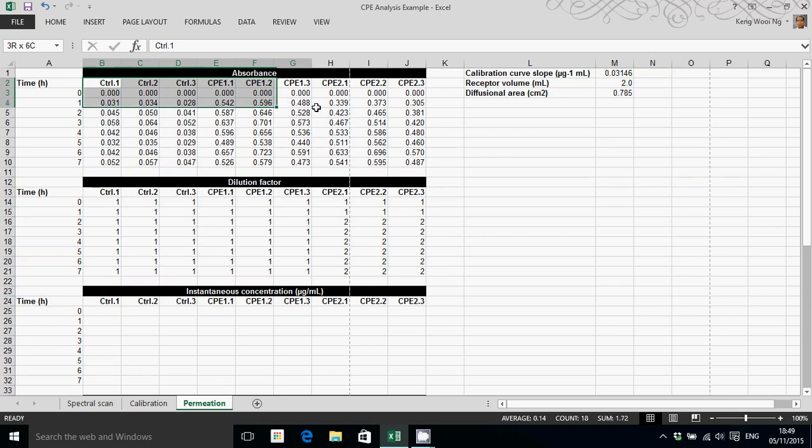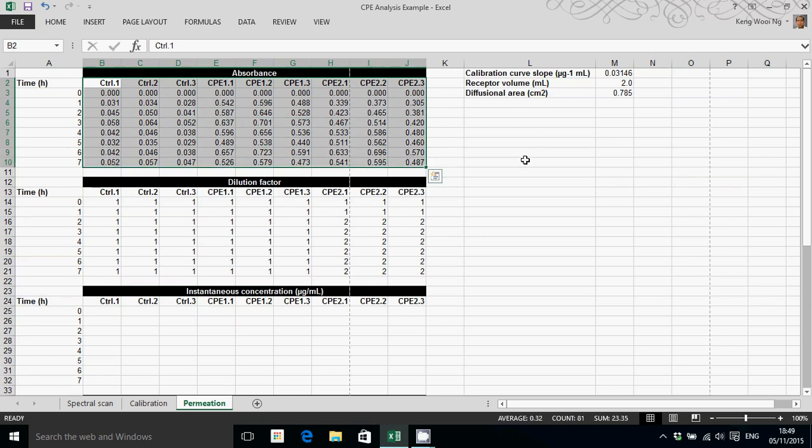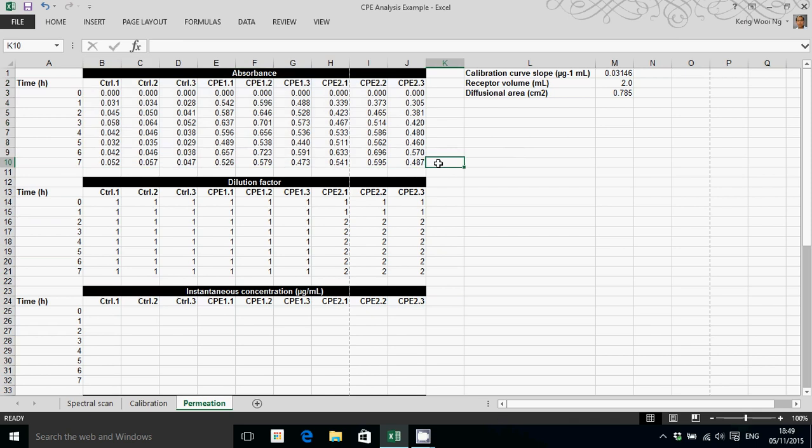This spreadsheet is laid out in a specific way that works for me. You may take this as an example which you may follow, or you may create your own spreadsheet layout. It's entirely up to you, whatever works for you. But this works for me.